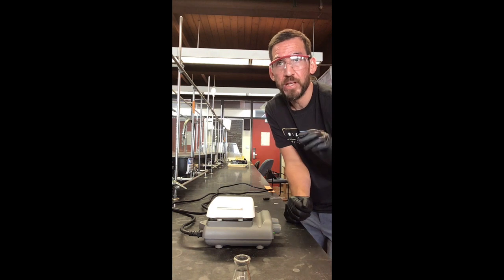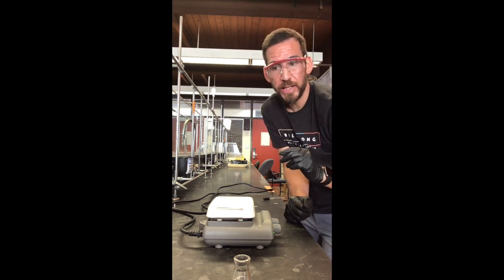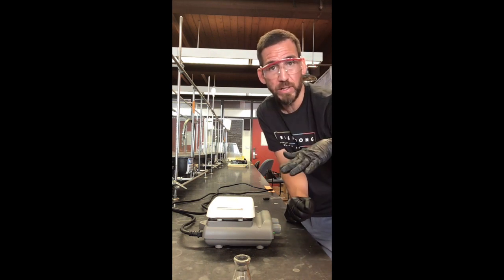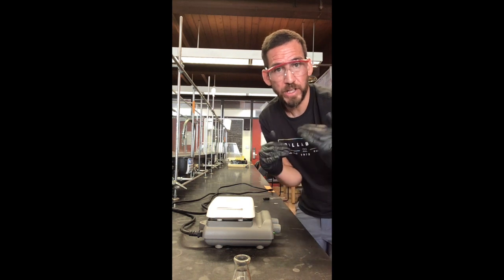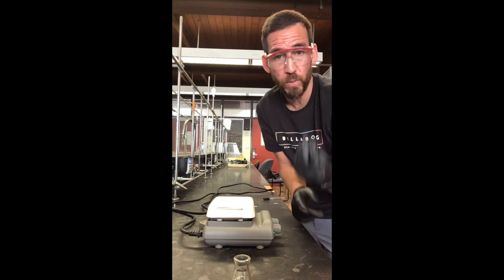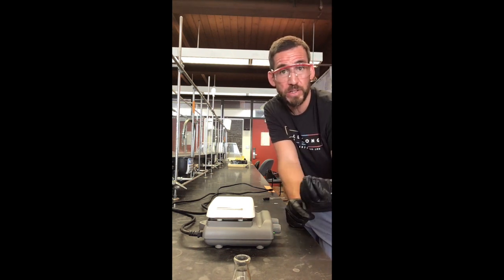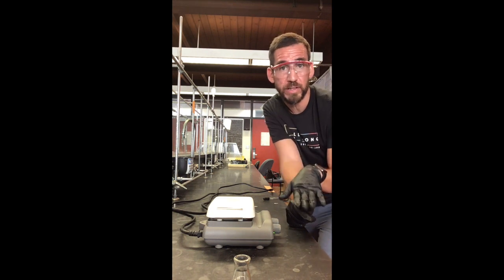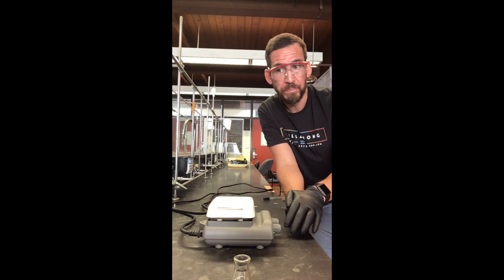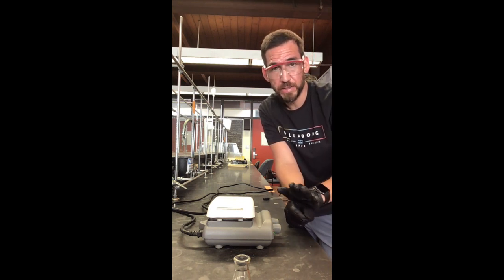And so let's say we dissolved a gram of caffeine inside X amount of hot solvent. As it cools down, it's not going to have that same ratio of solubility, and so it's going to either precipitate out, meaning form a solid, or it's going to form some nice crystals. If we let that cooling process occur as slow as possible, then we're going to get crystals.